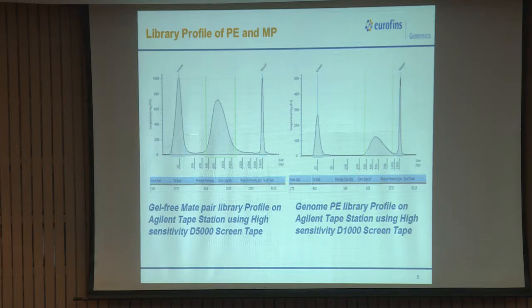2 into 150 is, we have two sets of reads of 150 bases, right. We will talk about it in detail. So, how it works and what is 150 and 2. It is a read length, right. So, reads are the sequences, the DNA template is sequenced 150 bases 2 times from the forward and from the reverse. In Sanger also we have a forward read and we have a reverse read. Similarly, in this also we have a forward read and a reverse read in case of paired end.